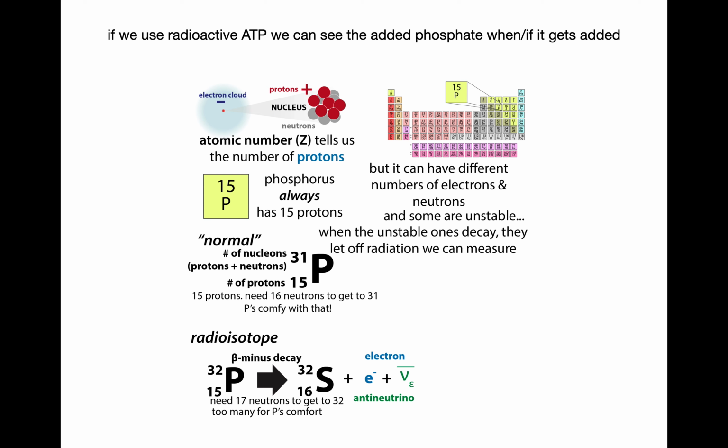So that's the idea. Again, lots more last week, but for now, just know that we have this radioactive phosphorus at the end, in that end phosphate group. That's the one that gets transferred to the substrate, the thing that the kinase is actually adding to. So an overview of how we do it: we take our substrate. Like I said, a substrate is just the name for the protein or the peptide that the kinase is actually going to phosphorylate.